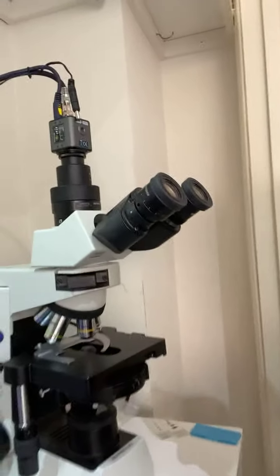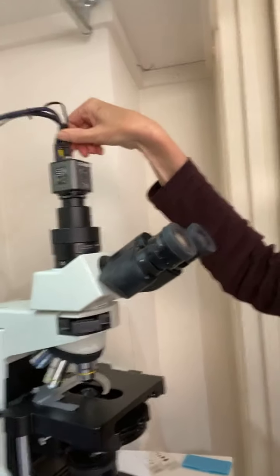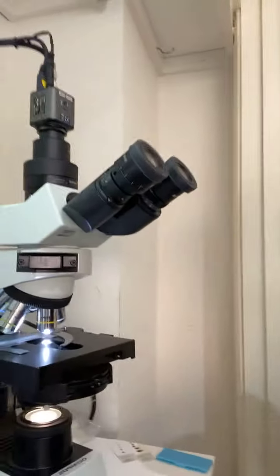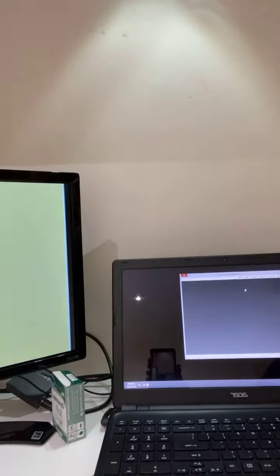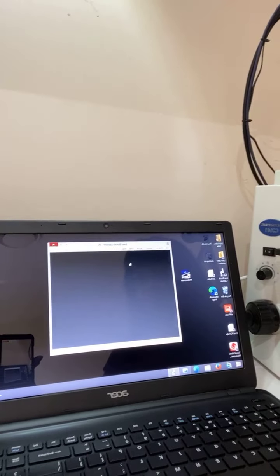Us naturopaths can all be a little mysterious sometimes. I'd like to introduce you to my beautiful, expensive equipment — this is the microscope. I'm going to plug it in and everything comes to life. Switch the light on, and we can then see it on the computer. I'll show you that in a minute, and then the client gets to see it on the TV screen, even more magnified.